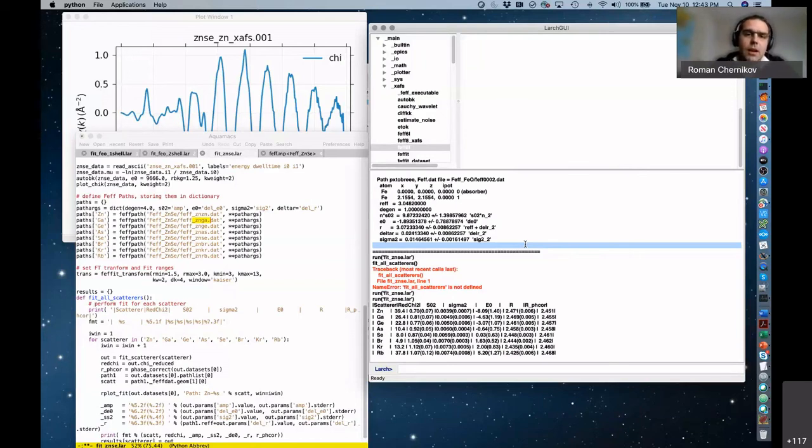Certainly possible to do that. It's not a bad idea. It does remove part of the spectrum, normalization problems, for instance. And it can also emphasize some noise portions, but it's a fine thing to do. I didn't show that, but it's a fine thing to do.